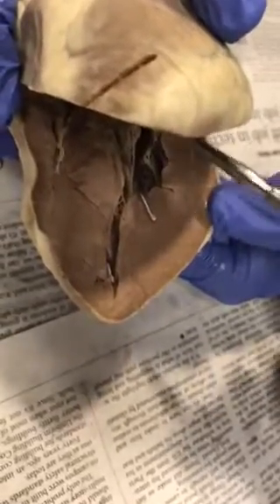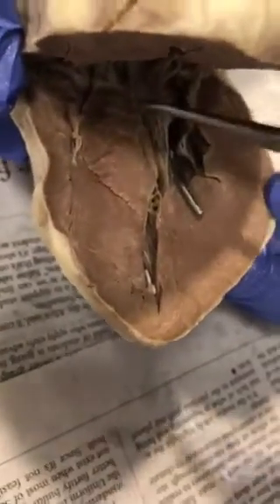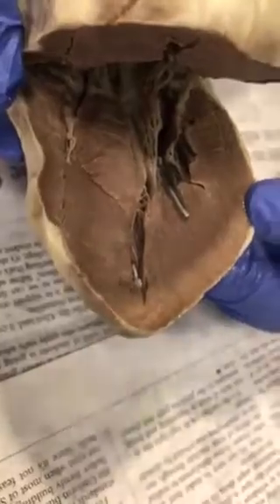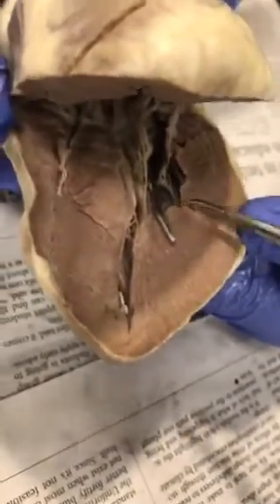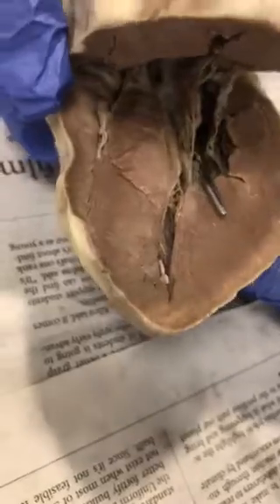And the chordae tendineae are these little fibrous things that are also attached to the papillary muscle right here. This is the valve that shuts closed when the blood is going between the left atrium and the left ventricle. And those are all held together. They're kind of strong. And you can see the different fibers all around here.